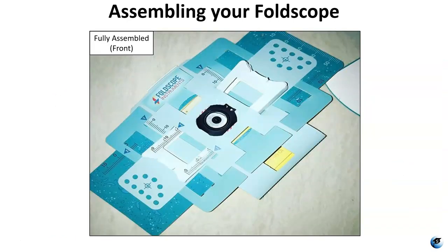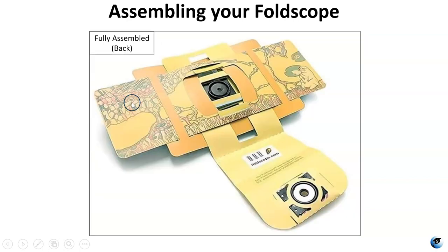Once the Foldscope is completely assembled it's going to look like this. This is the front. This here is a coupler that is holding the lens. This is the focusing ramp. These are panning strips. The blue side is the front side — you see the Foldscope Instruments logo here — and then the back side is going to be the yellow side.